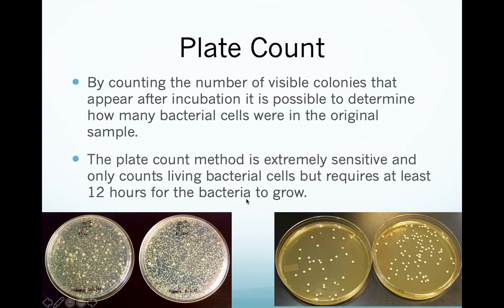Now, plate counts are cool. This is a viable cell count. It only looks at living colonies. Now, this is used a lot for environmental samples when you need to figure out how much bacteria is, say, in a water sample or things like that.